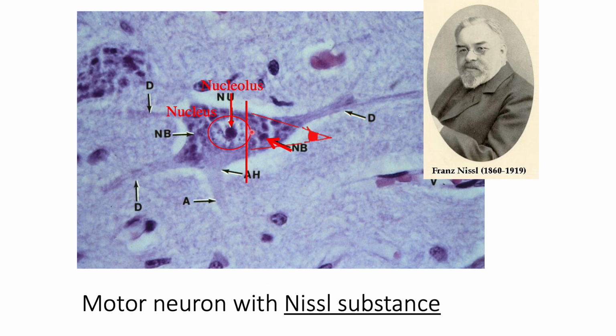So with this particular stain, you can actually identify the axon, okay, and the axon hillock. All these are Nissl bodies or granules that are contained within the cytoplasm. That is the nucleus. So that is the axon, and you can see it is paler than the rest. These are dendrites. That's another one there with a D, and there's another one there.